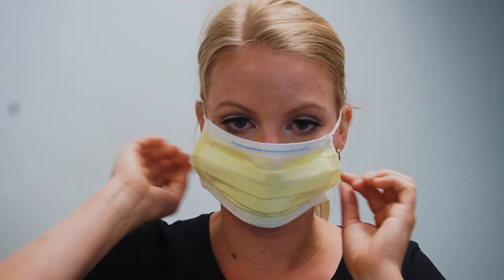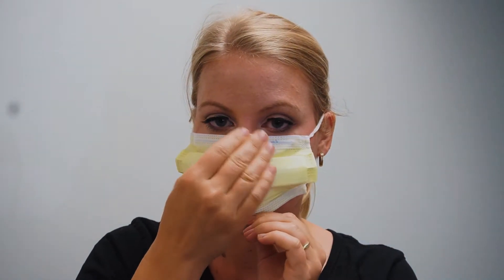Place ear loops on both ears. With both hands, shape the wire to your face and nose. Ensure the mask sits up higher to reduce fogging of eye protection.